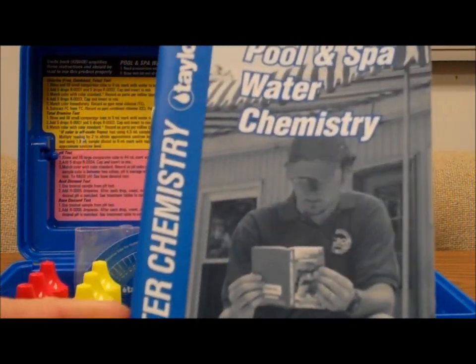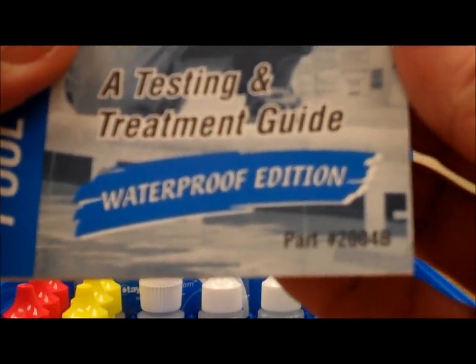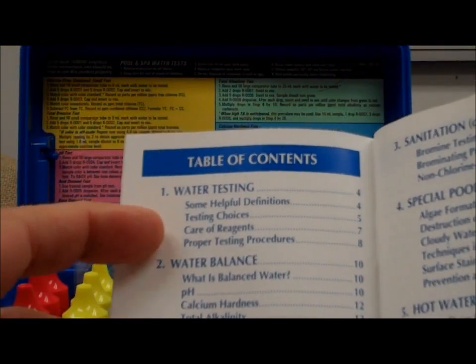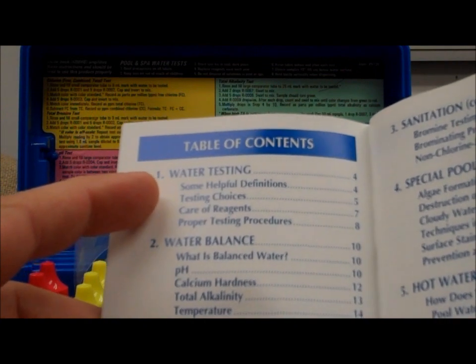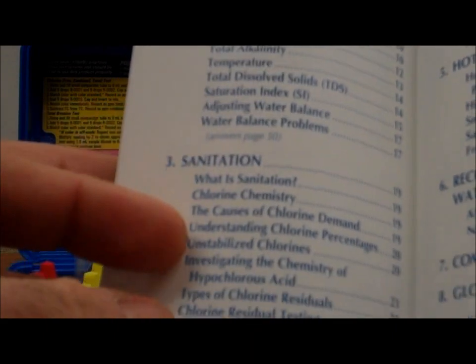It's the waterproof edition — that's interesting, it used to get pretty waterlogged back in the day. Inside here we've got definitions on pool water testing, discussion of pool water balance, sanitation, and great information on this handbook.